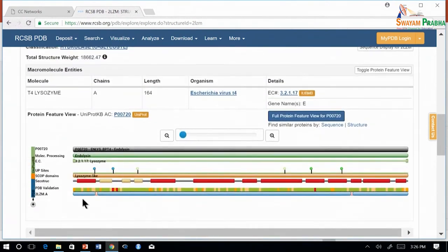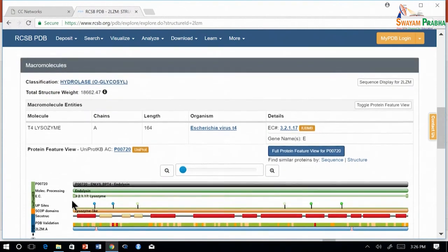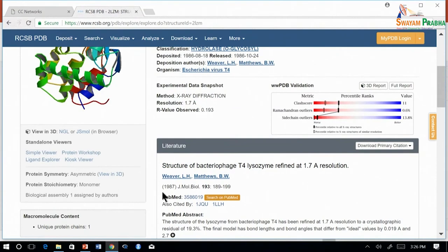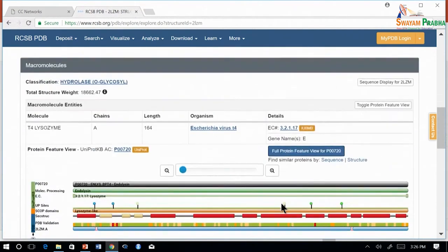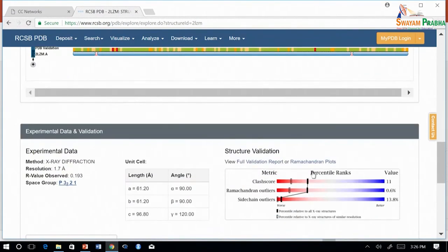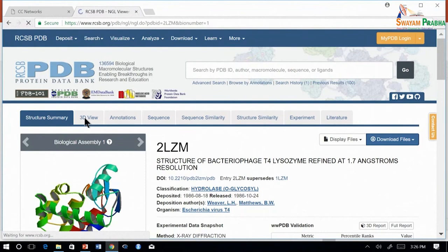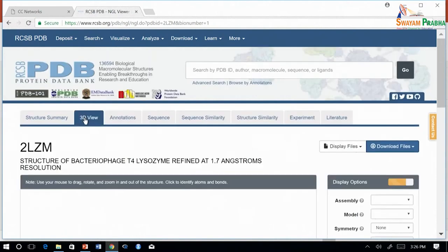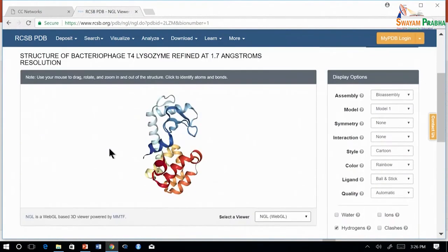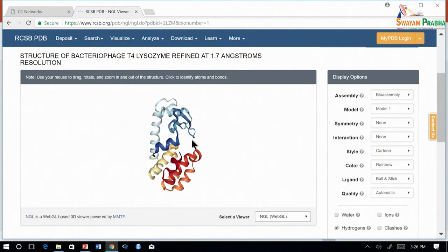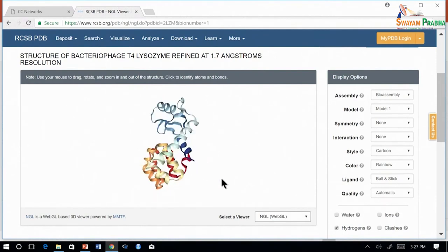You can also see the feature view here. In this page you can also link to other databases such as PubMed and UniProt, and you can also view the Ramachandran plot here. We will move on to see the 3D structure. We can also have a 3D structure here, or you can go and download the structure and view it in PyMOL. So in the PDB website itself you can see the structure in the NGL viewer. You can drag, rotate, and see the multiple views.